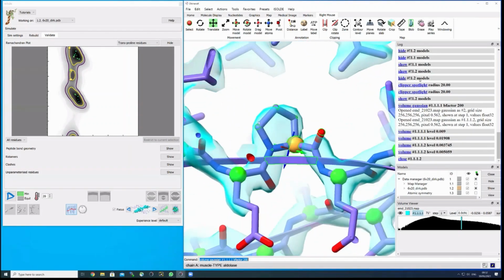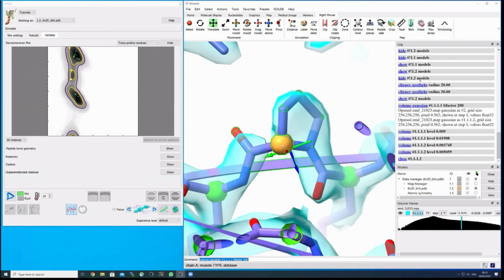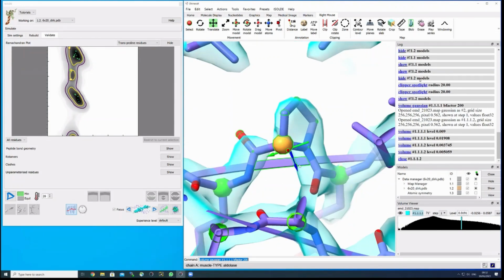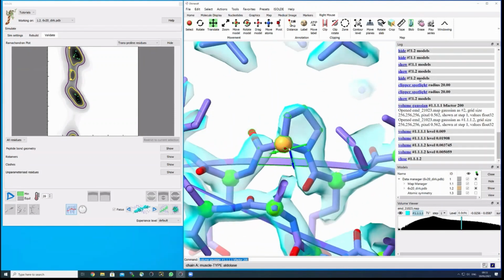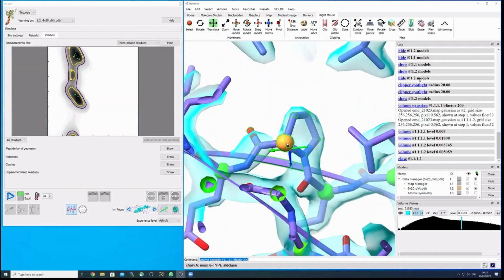Now you see this position and you can investigate a little bit. The first thing, and this is what it tells you here, is the orange color of this C alpha. It tells you that the backbone geometry is not in the favored area of the Ramachandran plot, whereas the neighbors are fine. This is just a basic investigation now. So this is one of these metrics that we are looking for.